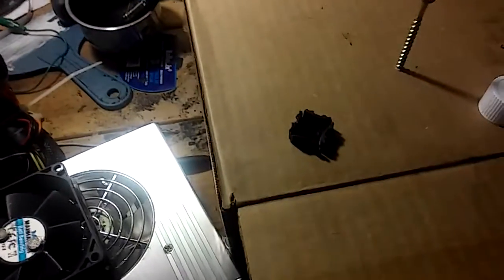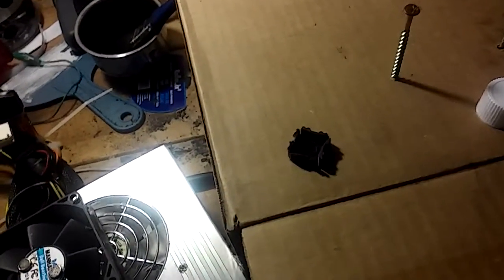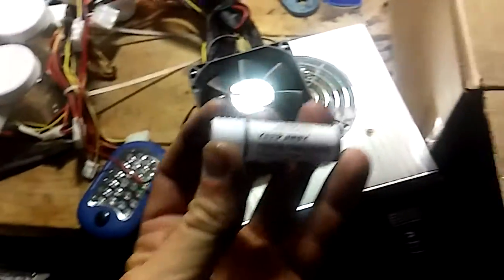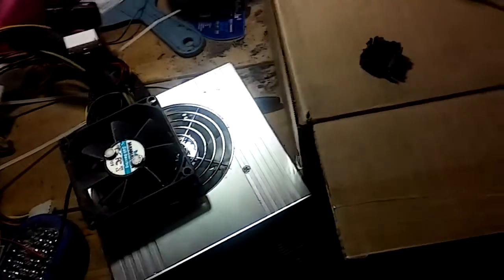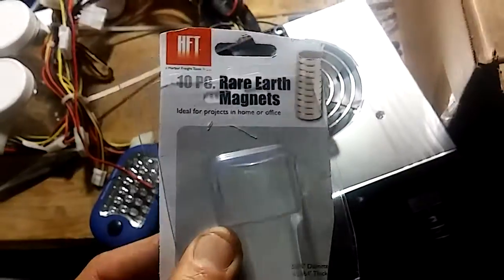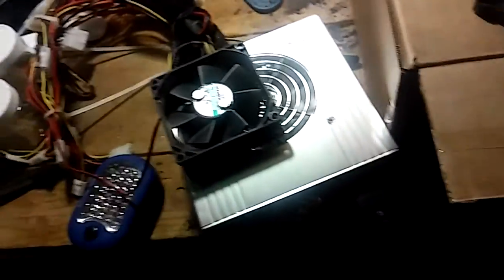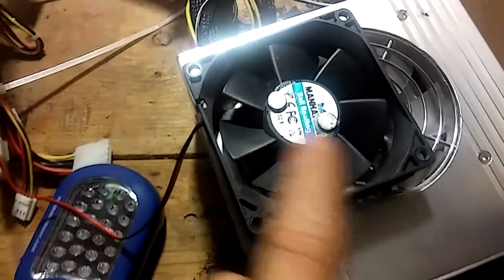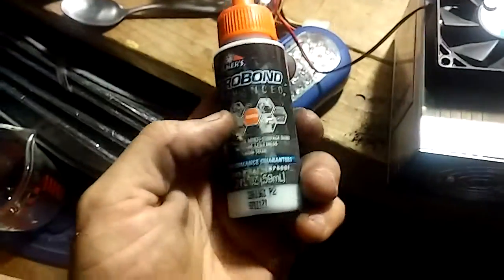I've taken these neodymium magnets that I got from Harbor Freight — they're like two bucks, $2.99 maybe, for a stack of ten rare earth magnets. I'm gonna take two of them and I've glued them on with some pretty good glue, this Pro Bond stuff, glued it right to the fan.